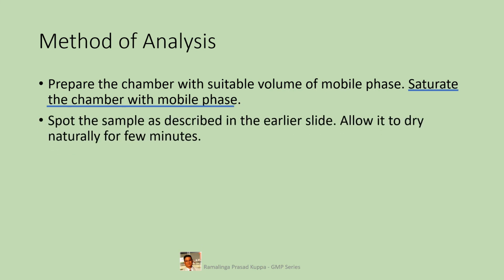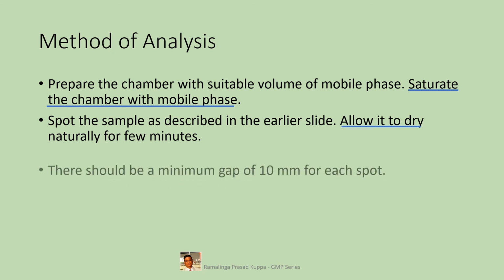Spot the sample as described in the earlier slide. Allow it to dry naturally for a few minutes. Spotting of the sample or standard solution has to be done as prescribed in the previous slide. Allow the plate to dry naturally for a few minutes. Generally 5 or 6 minutes would be okay.